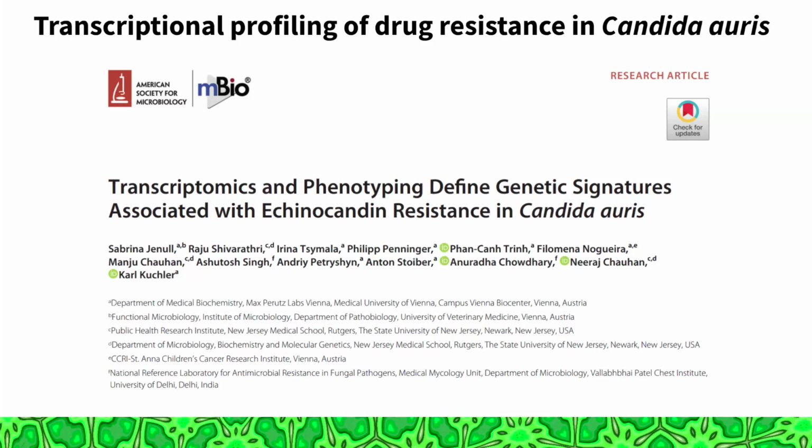When you look at a paper like this, you might want to replicate what they've done, maybe reanalyze it, or see what they've done and apply this to your data. So in what I'm going to show you today, I will essentially reanalyze their study using the BRC Analytics framework.